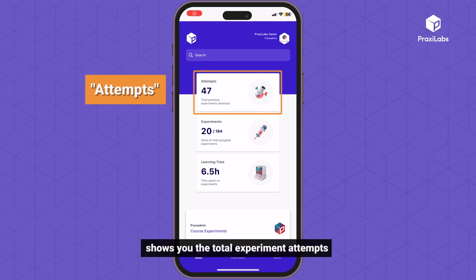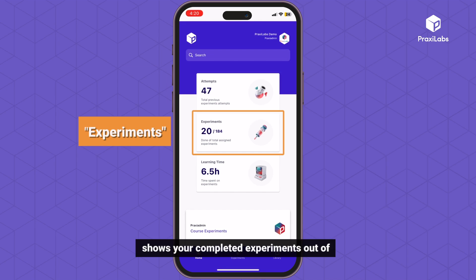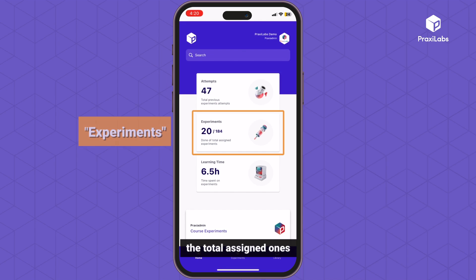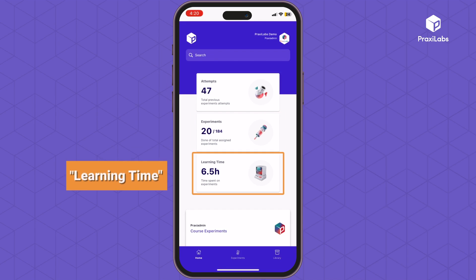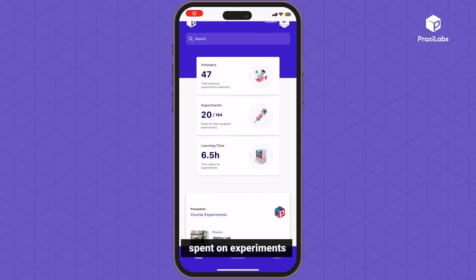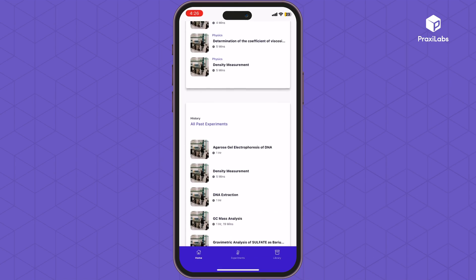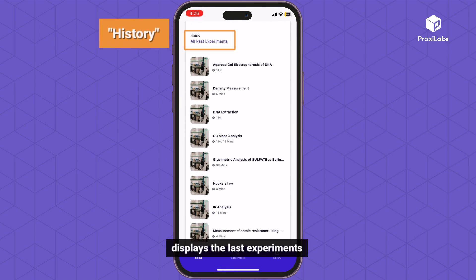Attempts shows you the total experiment attempts. Experiments shows your completed experiments out of the total assigned ones. Learning time is the total amount of time you spent on experiments. History displays the last experiments a student conducted.